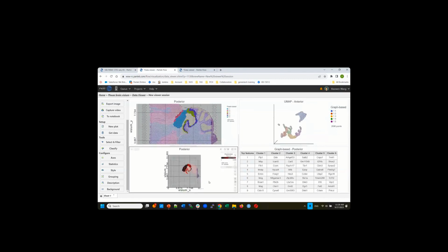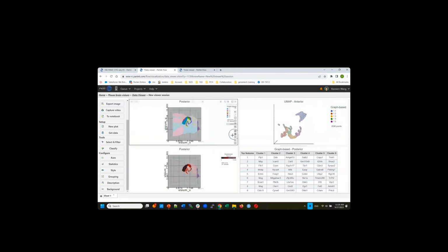Okay, so that's another new feature in this new version of Flow. The concept of identifying the cell type is going to be very much the same, and using spatial transcriptome, you will have one more layer of information to look at your data. With that, I would like to take questions.